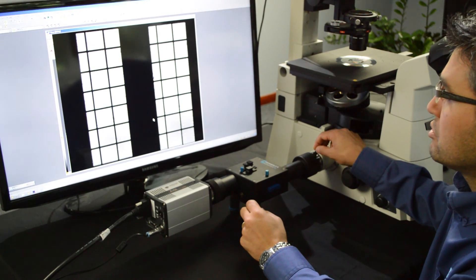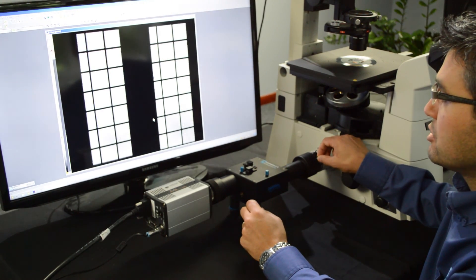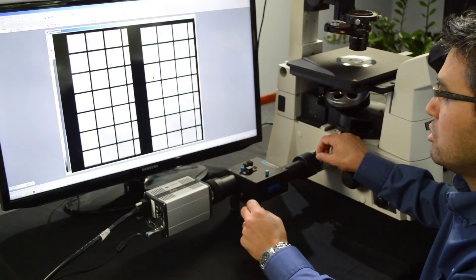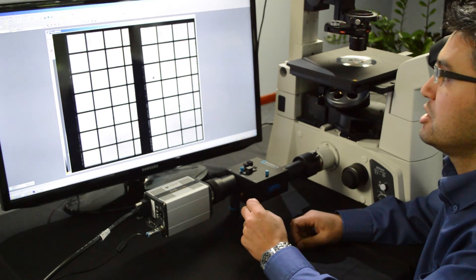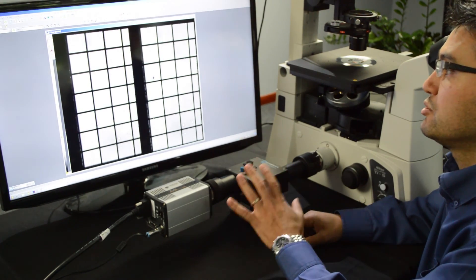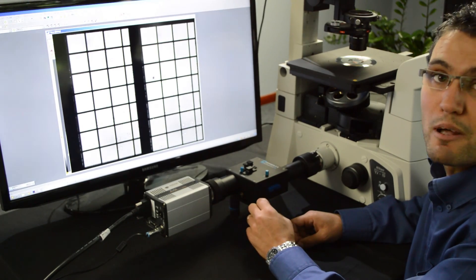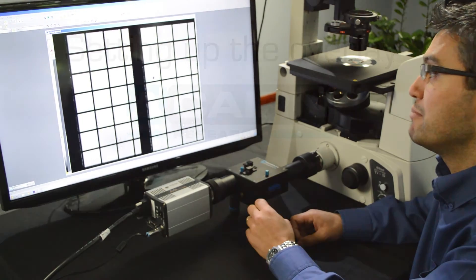You can use the horizontal aperture control to fill as much of your chip as you can, so you can use as much of your field of view as possible for your imaging.